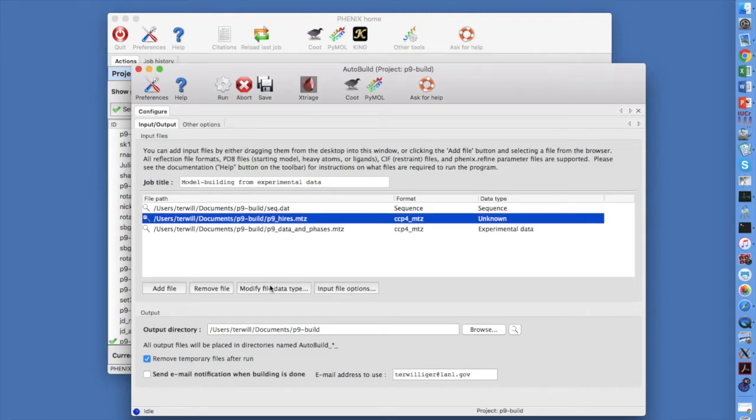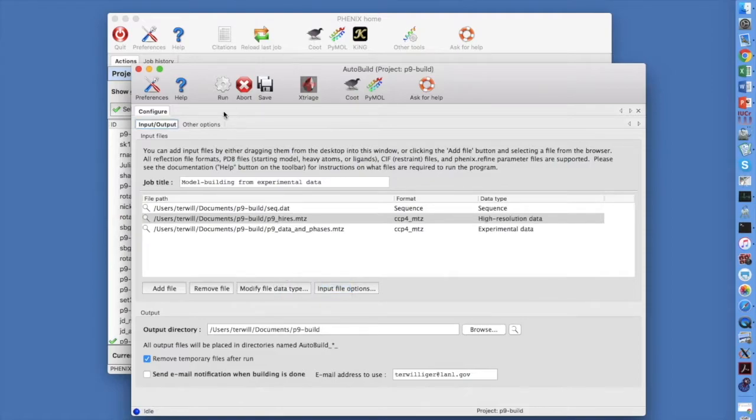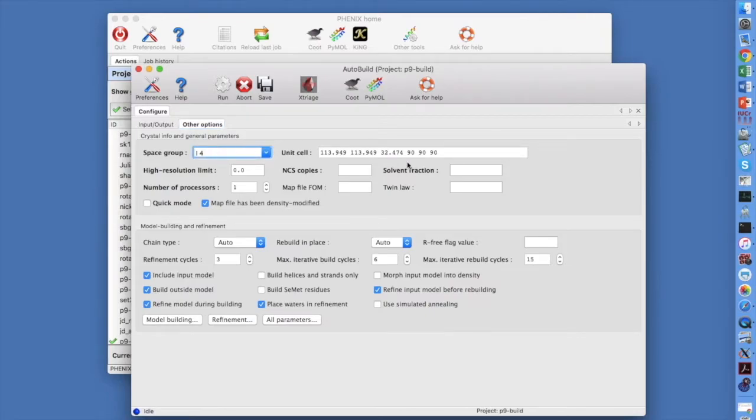Tell the GUI that P9HiRes.mtz contains Hi-Res information. Click on the Other Options tab. We are going to set a few parameters. Make sure the space group and unit cell are what we expect.